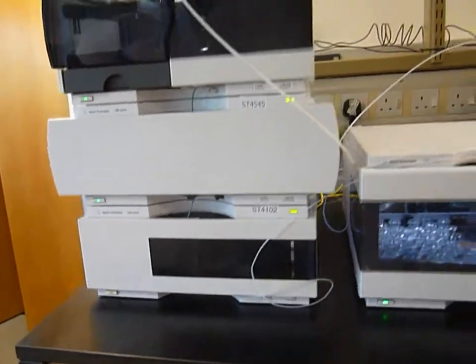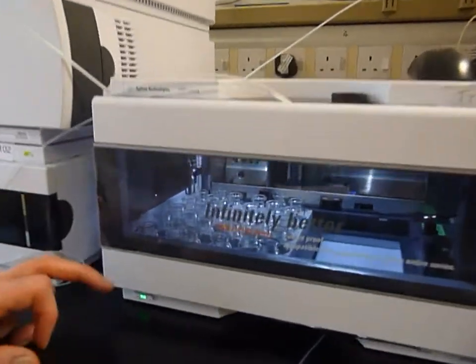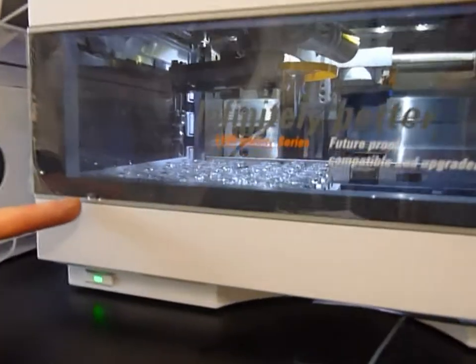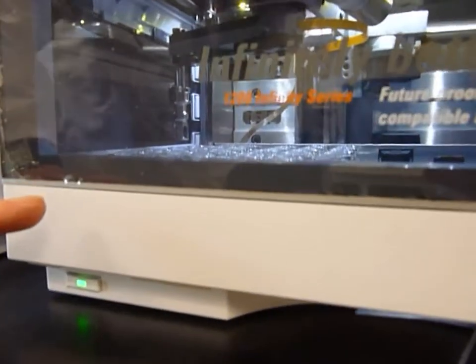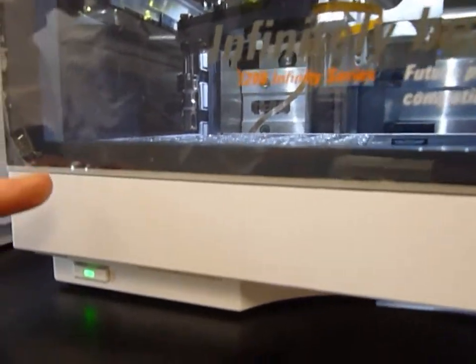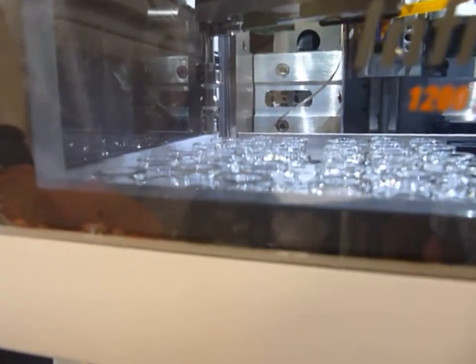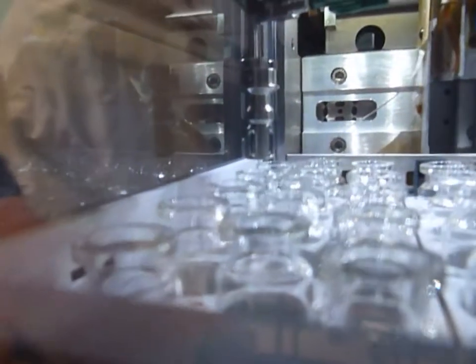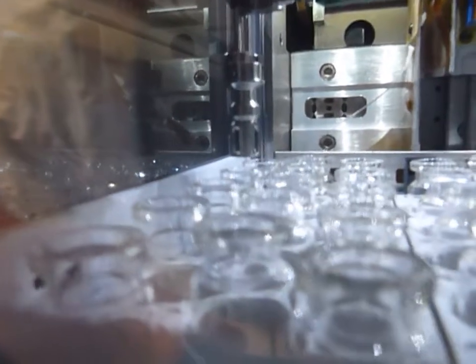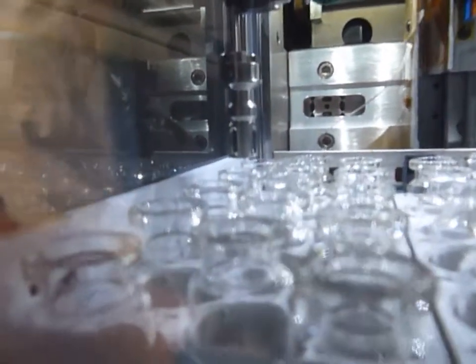A nice feature of this, which is for analytical prep probably up to about 1 to 2 mg scale, is this very neat little auto sampler, or fraction collector, that's used to collect the peptide fractions.